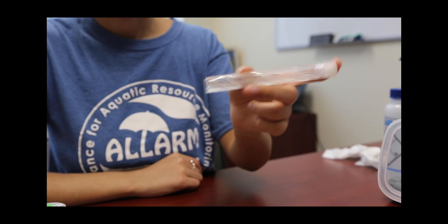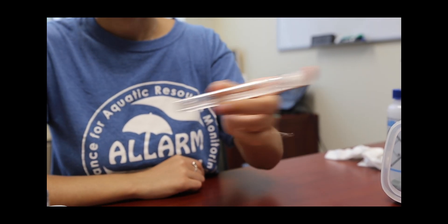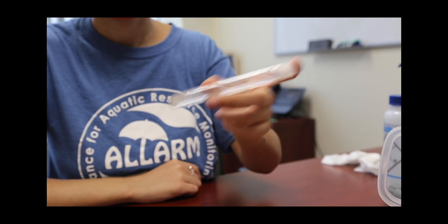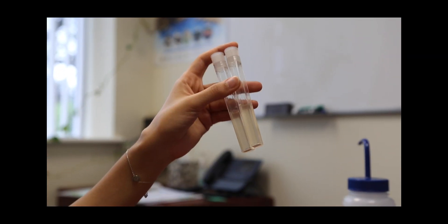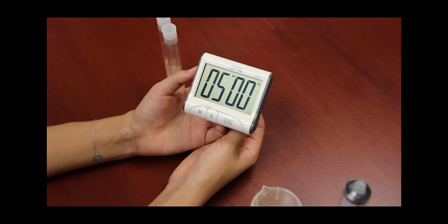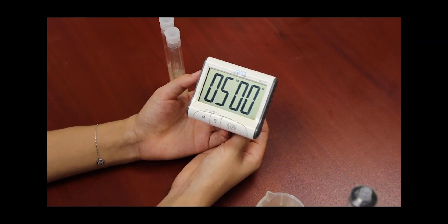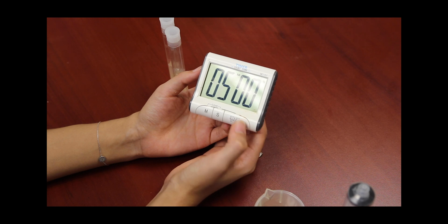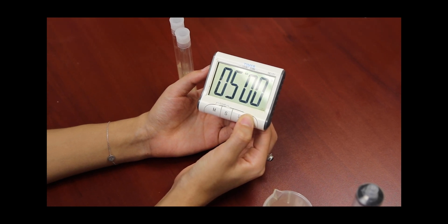You can also run your two replicates simultaneously. If you choose to do this, hold and shake both test tubes in the same hand for consistency. Once the two minutes are up, put the samples down and set the timer for 5 minutes and wait for the reaction to finish.